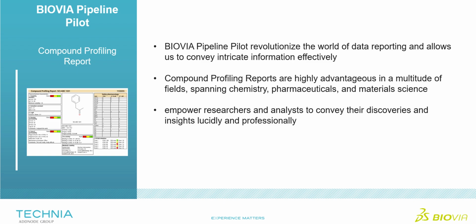Reports of this nature are highly advantageous in a multitude of fields, spanning chemistry, pharmaceuticals, and material science. They empower researchers and analysts to convey their discoveries and insights lucidly and professionally. BIOVIA Pipeline Pilot bestows upon us the power to fabricate compound profiling reports in PDF format. These reports, characterized by multiple columns on a landscape oriented page, revolutionize the world of data reporting.